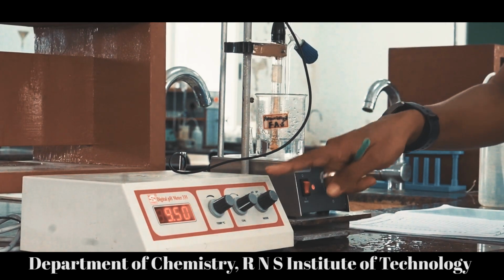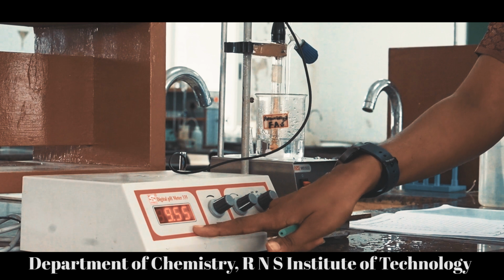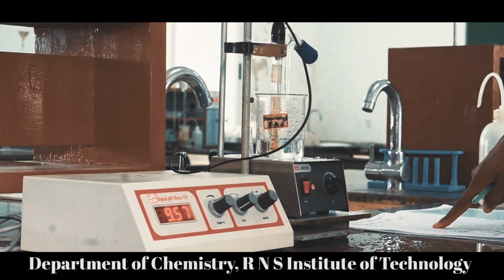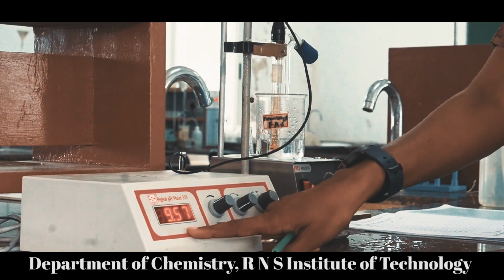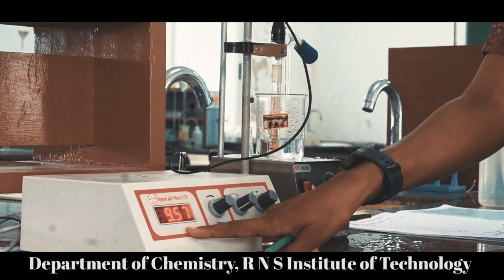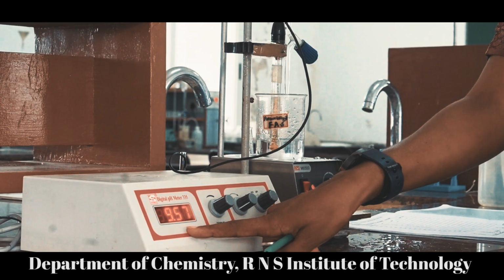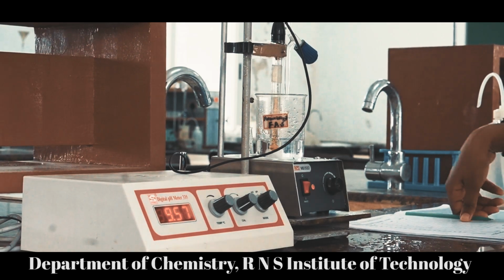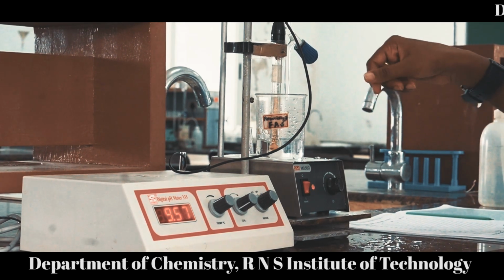Here we observe that there is a sudden jump in the pH value. Initially the value was 5.88 and now it has increased very sharply to 9.58. Let us record that, and we call this reading the equivalence point or jump in the pH value.